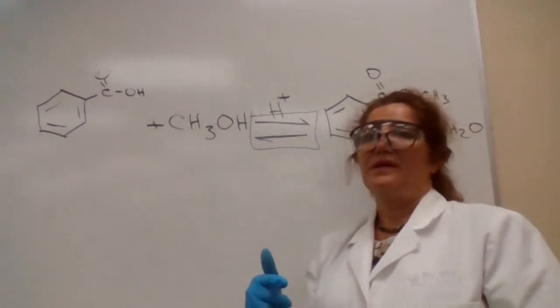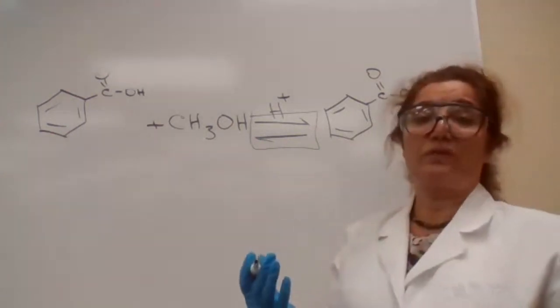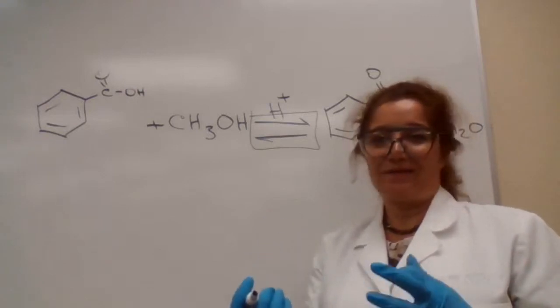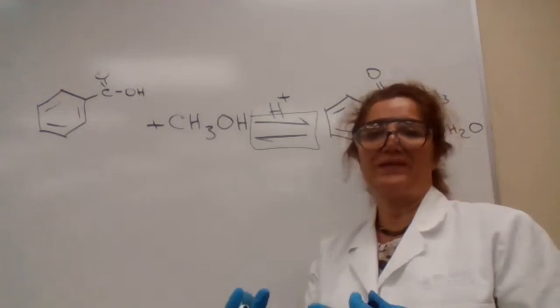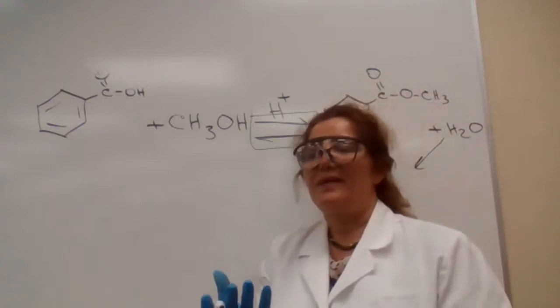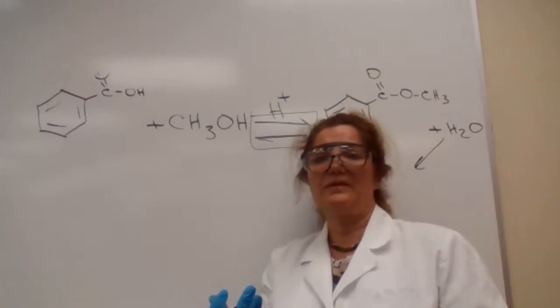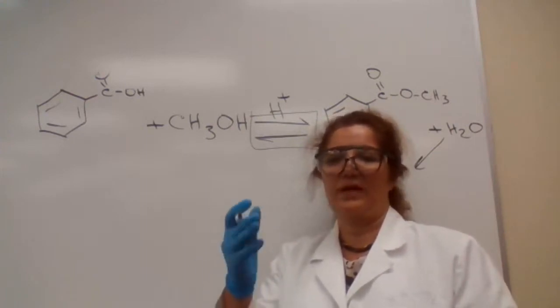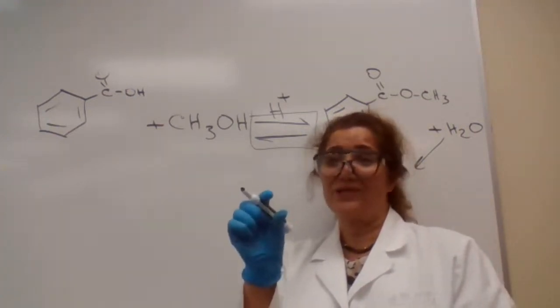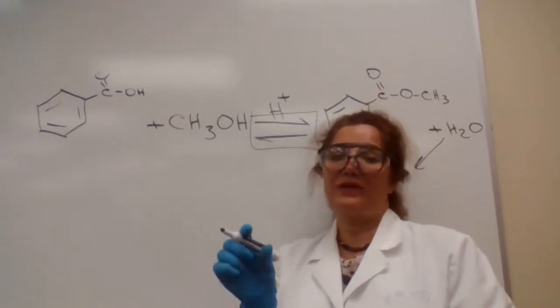The other method would be to add a water absorbent for the water. If you have beads of silica gel, like when you buy a leather product, such as leather shoes or leather clothes, something made with leather, you don't want it to absorb moisture because it can form mold or change shape for obvious reasons. I guess they put a little package of silica gel inside the box. So yes, you're not supposed to eat those.